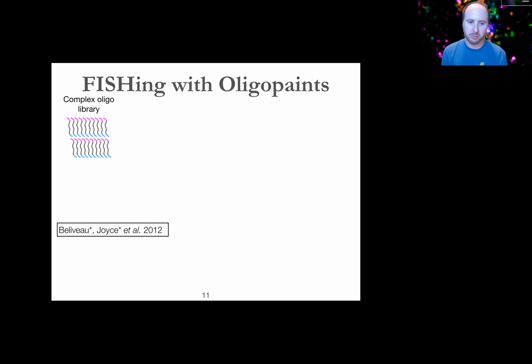More recently, you can do this using PCR products. That's a nice way to streamline that process and make it a little bit more specific. But in general, in those cases, you're still using relatively large chunks of genomic sequence that you pick in blocks, and you're starting directly from the source material of the organism's genomic DNA or cDNA. By contrast, the Oligopaint technology and a couple of companion technologies that were introduced by Agilent and Wendy Bickmore's lab around the same time work a bit differently, and they use synthetic DNA made by massively parallel oligonucleotide synthesis as the starting source of material.